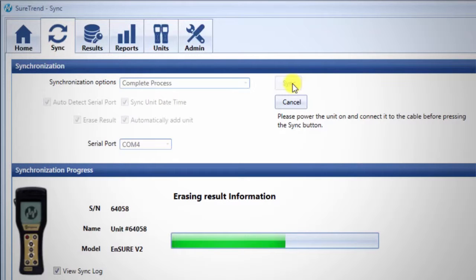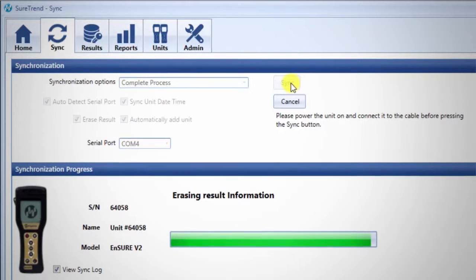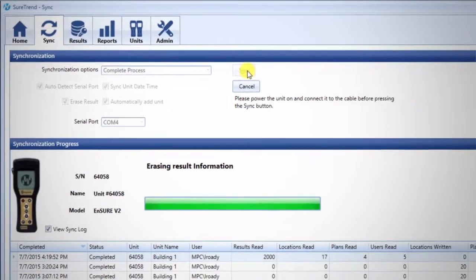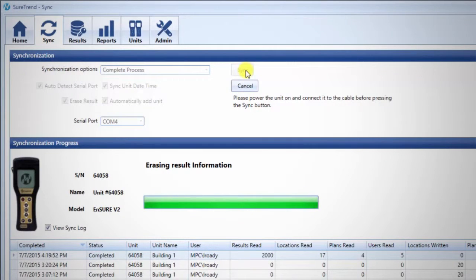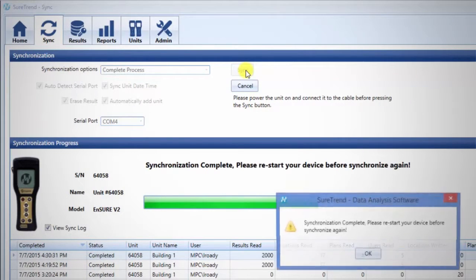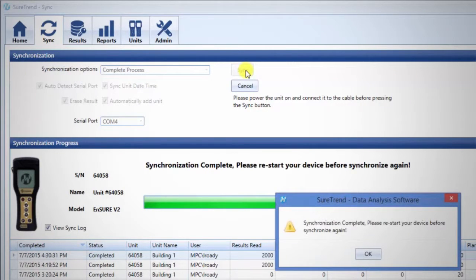Depending on the amount of results, or if you've made several changes, this process may take a few minutes. When synchronizing is complete, you will see a pop-up notification.